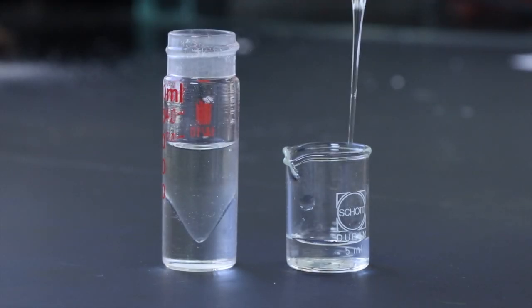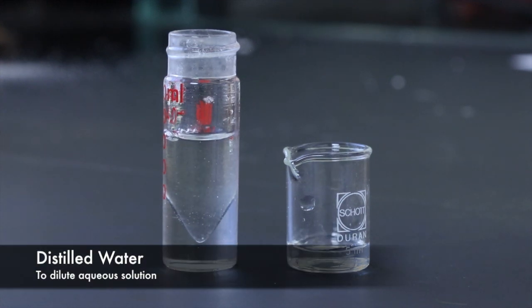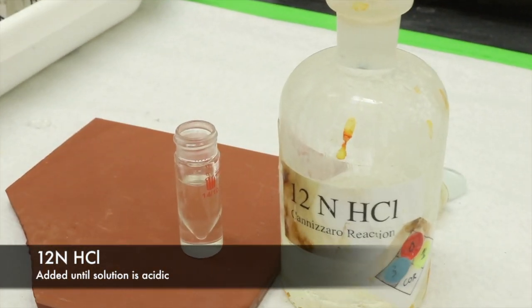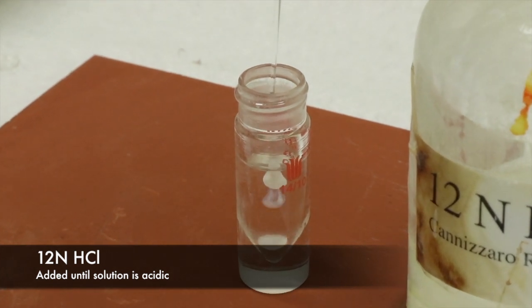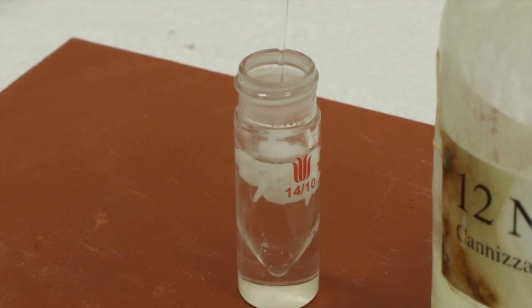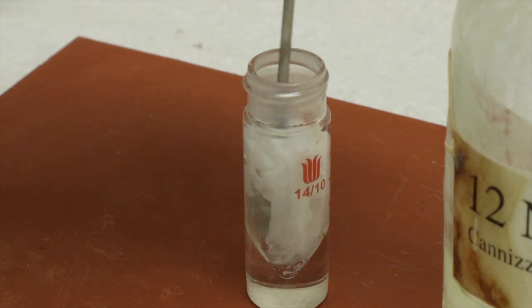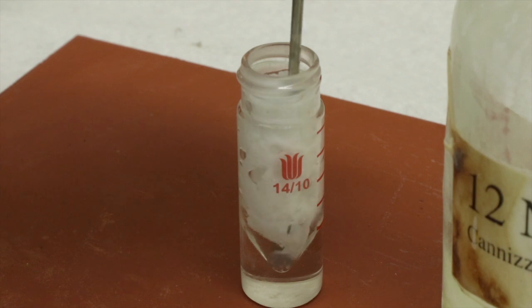Okay, I've got the conical vial with the acid product, and I'm going to dilute the solution a little bit more with some additional distilled water. Now I can add the concentrated hydrochloric acid, and you can see the product precipitating out of solution in that white slurry as it's neutralized by the added acid. And I'll make sure that I add enough so that the solution itself is acidic, meaning that all of the acid product will be protonated and no longer dissolved.